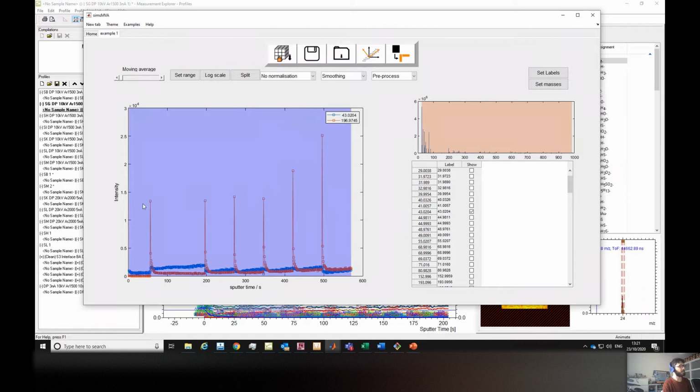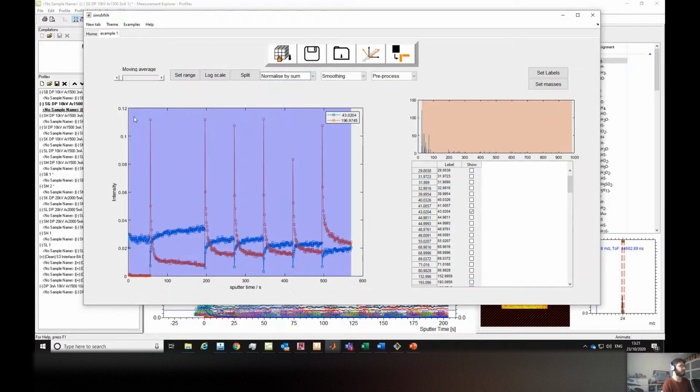So you won't be exactly sure that these differences are actually because of chemical changes or concentrations rather than just acquisition time or things like this. So we can normalize everything by the sum of all peaks. We will get the total intensity of the entire peak list and divide each peak by it. So you can see, now for each level, all the ions' intensity will add up to 100%.